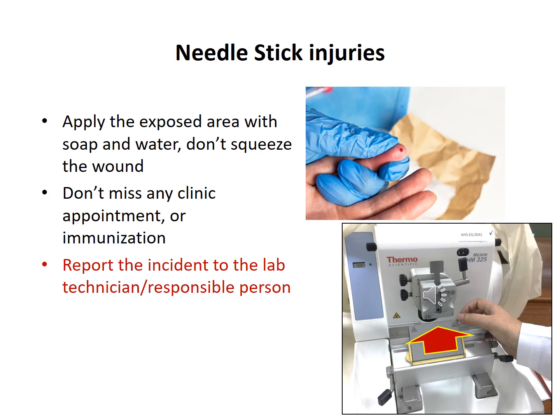And for example, in other labs, there are chances of injury. For example, you are using a NanoDrop, so it's a very small needle, okay? Sometimes if you are doing sampling like DNA quantification, your hand can be hurt by this very sharp needle. Okay, so this is also very common, needle injuries in all the biolabs.